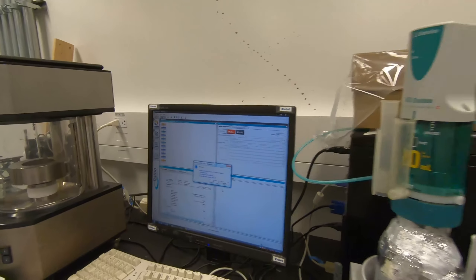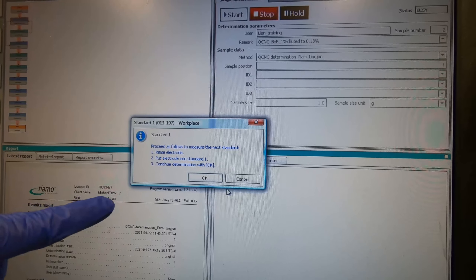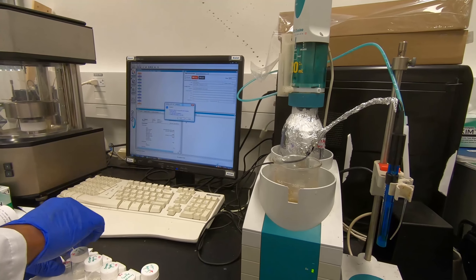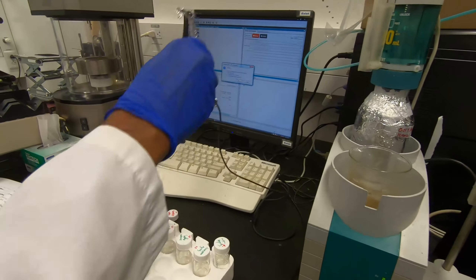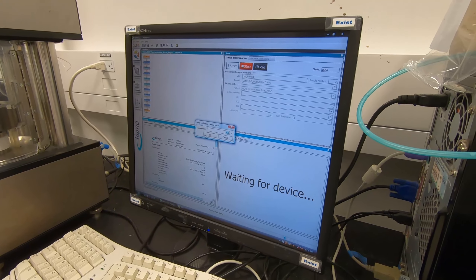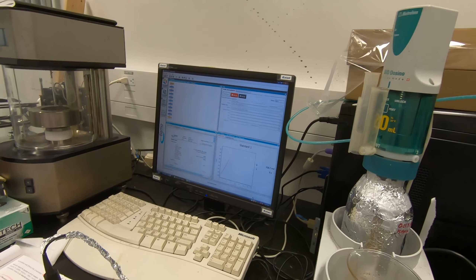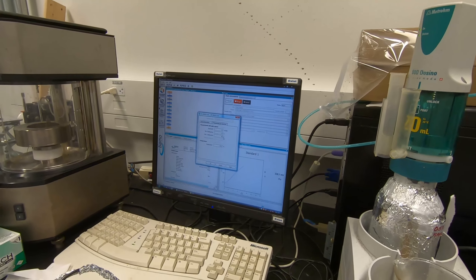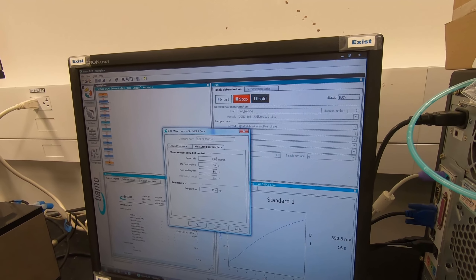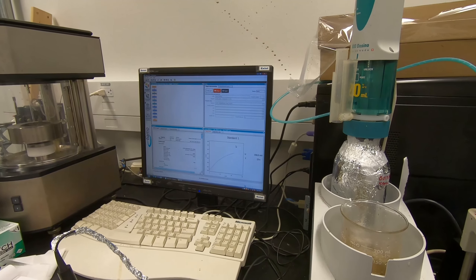Save and wait. Place your standards one by one - rinse the electrode and put it into standard one. We are putting it in standard one: 10 ppm. Press OK, it will ask for the temperature, just press OK, then it will start. We already set up 60 seconds - they recommend at least one minute so it stabilizes, giving better calibration performance.